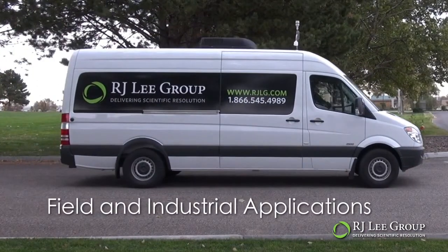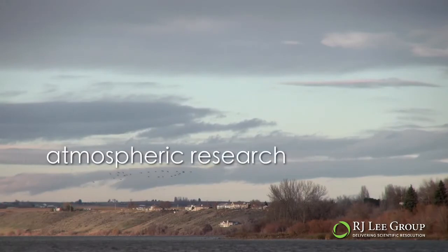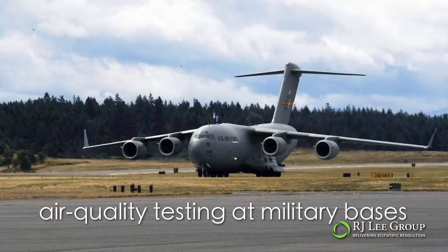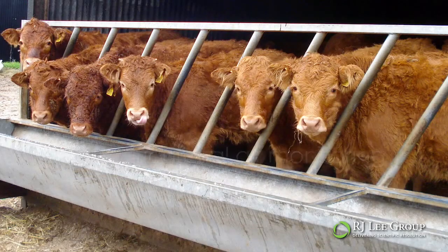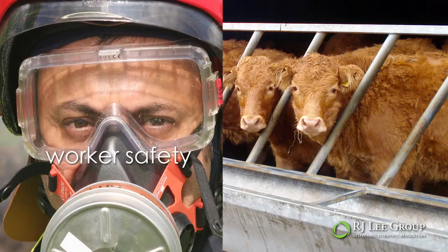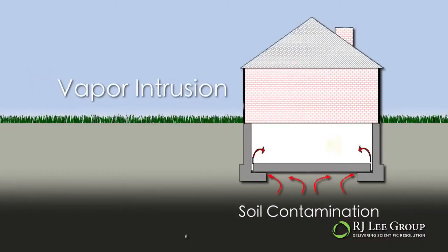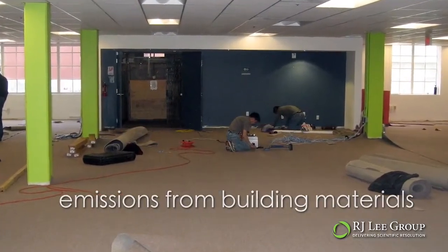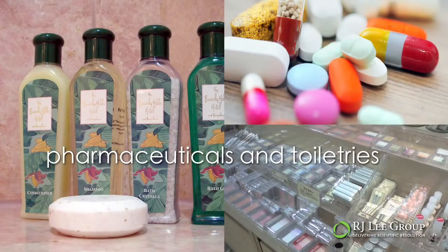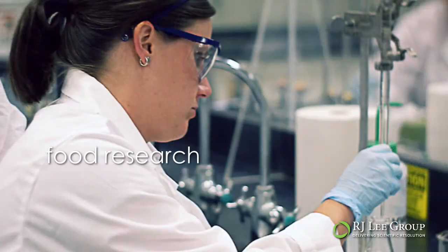Here are just a few applications for which the mobile laboratory is ideally suited: site and environmental monitoring, atmospheric research, air quality testing at military bases and air base hangars, agricultural air quality monitoring, air quality screening for worker safety, breath analysis as a medical diagnostic tool, vapor intrusion detection, measurement of chemical emissions of building materials, pharmaceutical, cosmetics and toiletry manufacturing, microelectronics manufacturing, and food research.